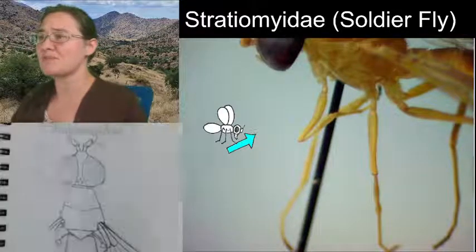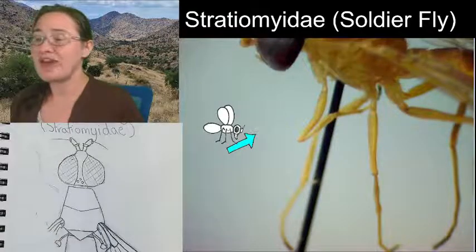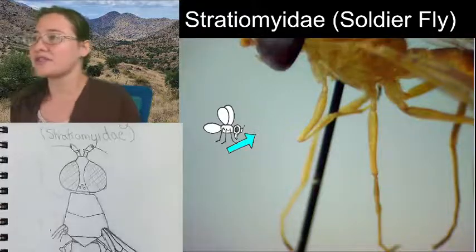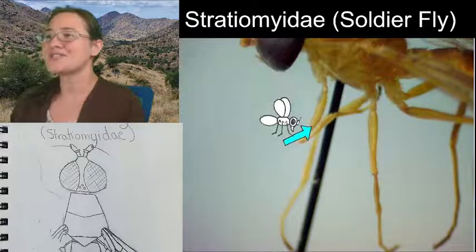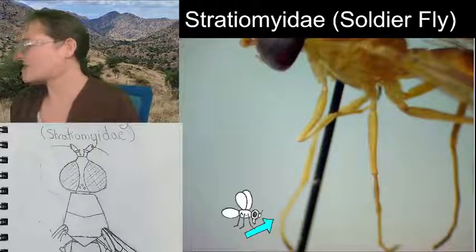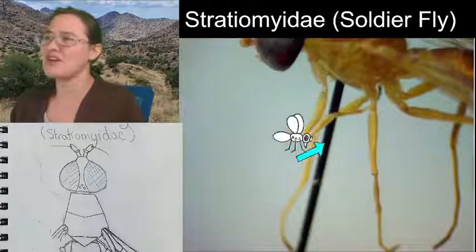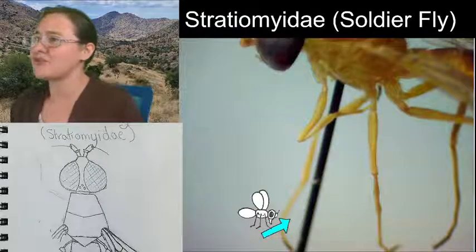Now, I was noticing right before I got kicked off that one of our front legs isn't there, and the other one is kind of tucked up underneath the body, so it's a little bit difficult to see, but all of the other legs are hanging really low. So I find that interesting. There's no way that I would do this nowadays, because if your legs are hanging so low, that gets rid of space that you had for your labels, right?